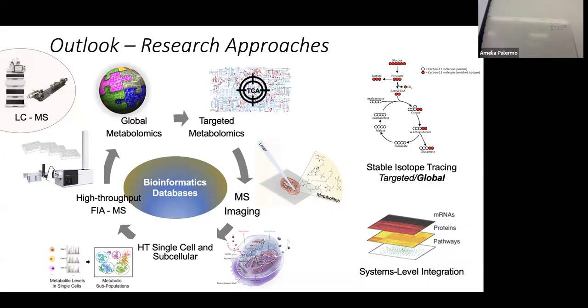The other approach, with a very high resolution in terms of cells but not in terms of space, is online single-cell metabolomics, where a microfluidics apparatus prior to the mass spec and the LC system separates each cell, and then the extraction occurring online enables measuring each cell injected at a time in the mass spec. In that case, the data looks more like a population of cells.